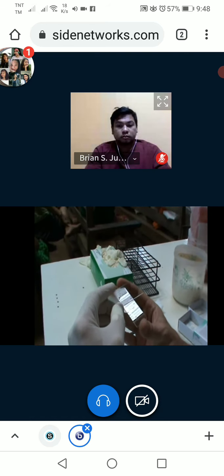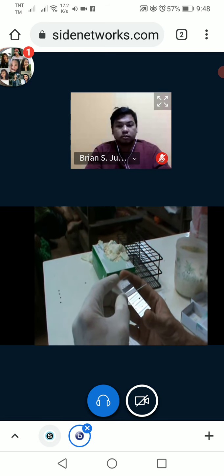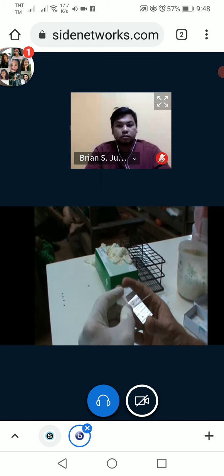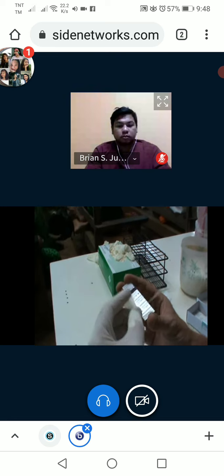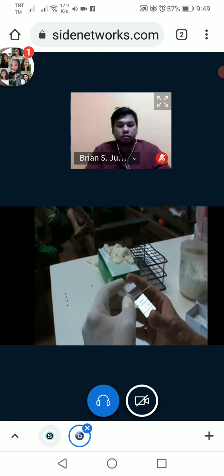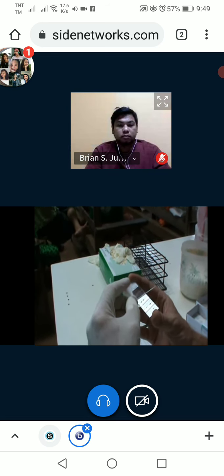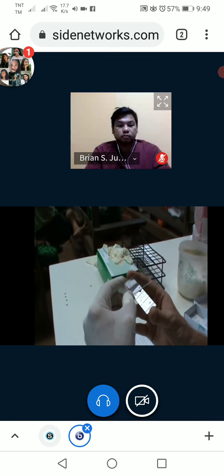To perform a good thin smear, your spreader should go forward in a regular move and not too fast. One of the common mistakes is that a too big drop of blood is applied on the slide, and then you need to spread the blood fast in order to keep the thin smear within the further edge of the slide. Remember, a small drop of blood, 2 to 3 microliter, is enough for the thin smear.